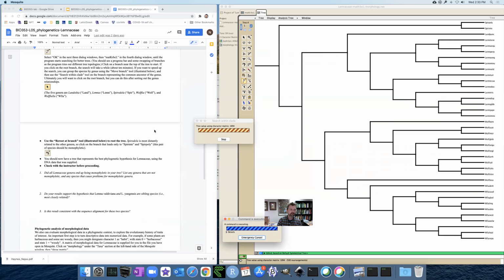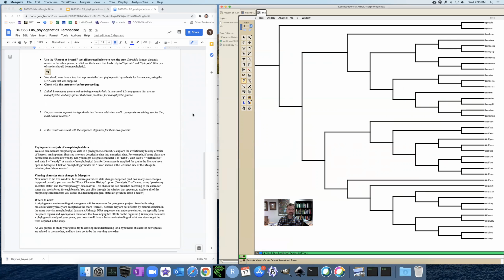All right. So we've already got it rooted. I'm searching within the rooted tree. Ooh, it stopped. It must be happy. I talked long enough. All right, so we're going to keep searching and then try to look at these questions here.